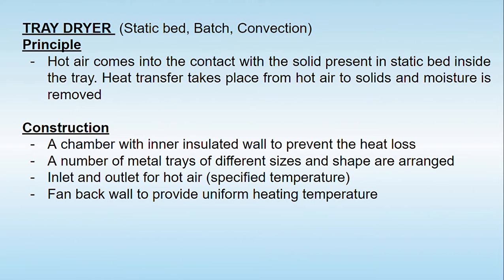Besides that, these trays are generally made of metal, so the hot air will heat the tray as well. Once the hot air hits the tray, the hot surface of that tray comes into contact with the material, and from that again the loss of moisture takes place.